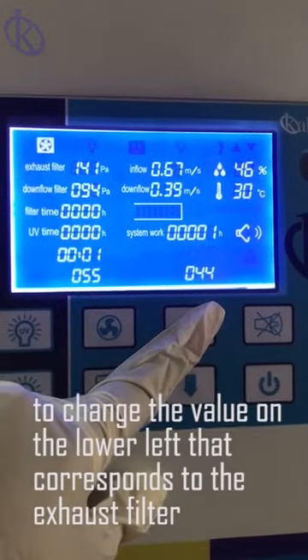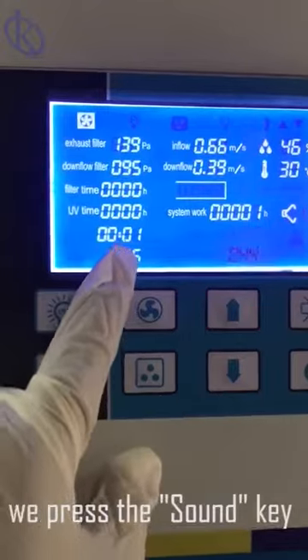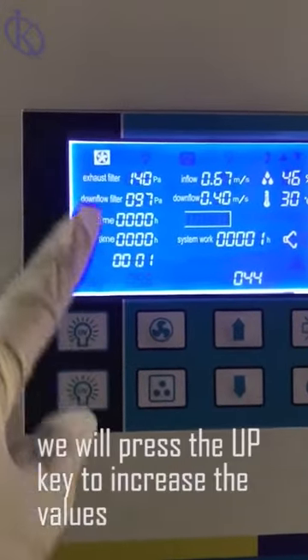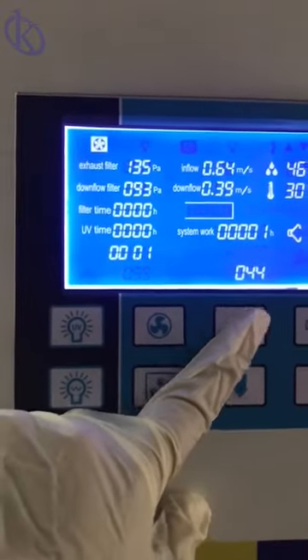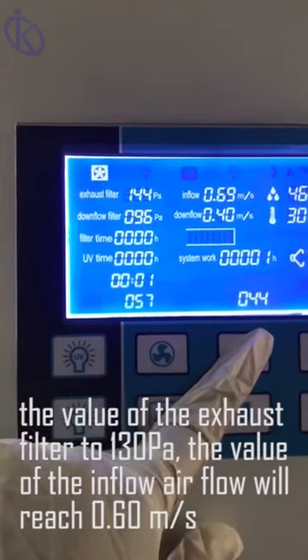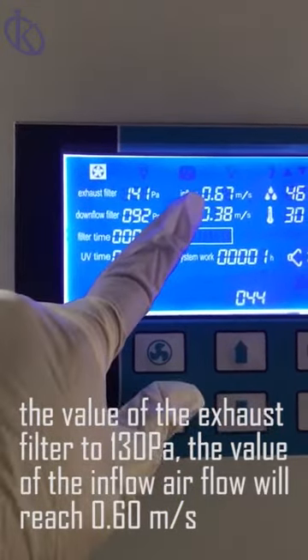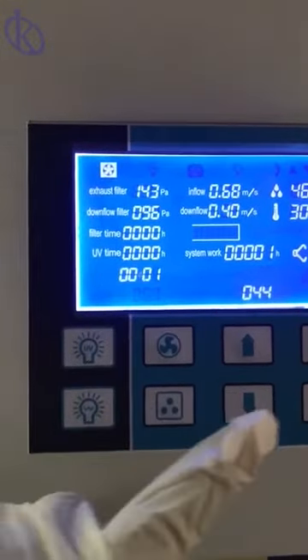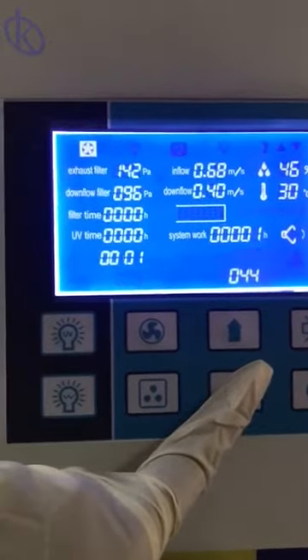To change the value on the lower left, which corresponds to the exhaust filter, we press the sound key. As in the previous step, we press the up key to increase the values. By raising or lowering the value of the exhaust filter to 130 Pa, the inflow airflow will reach 0.60 m per second — that is, 0.53 to 0.54 in the lower value of the screen.